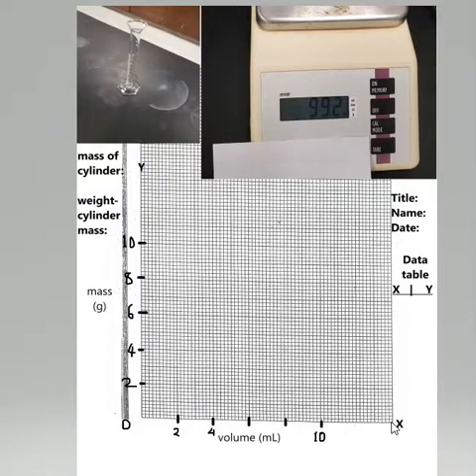So this is kind of a cool experiment. It integrates a lot of skill and a lot of your beginning knowledge in chemistry. Keep going. Keep up the good work.